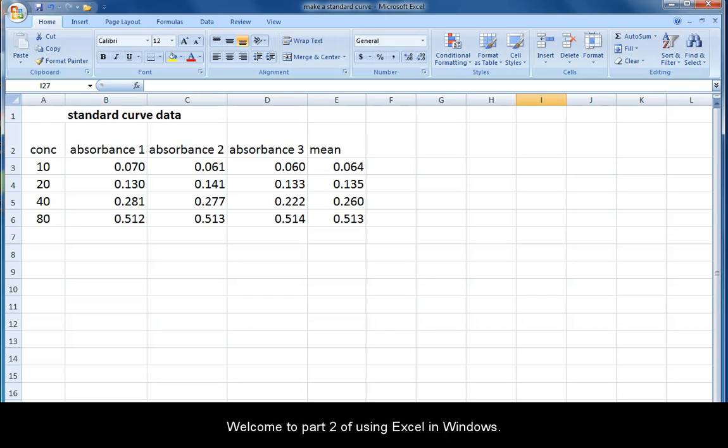Welcome to part two of using Excel in Windows. In this video we will make a standard curve using the data we worked with in tutorial one.